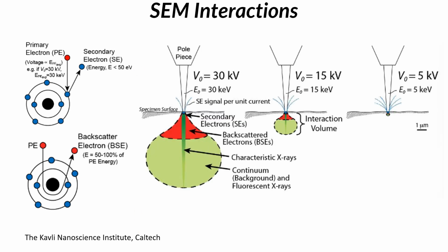Once the electron probe hits the sample, you will generate an interaction volume. The smaller your accelerating voltage, the smaller the interaction volume. While it may seem like more interaction volume is better, for the most part it's not true. More interaction volume means that you'll have more noise.